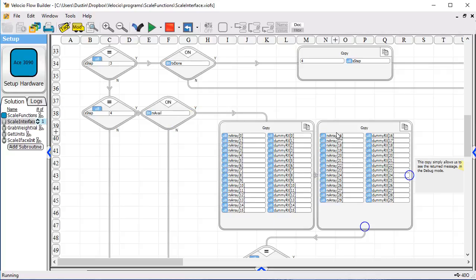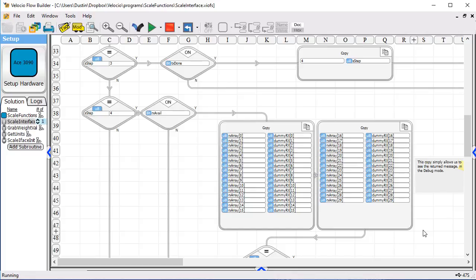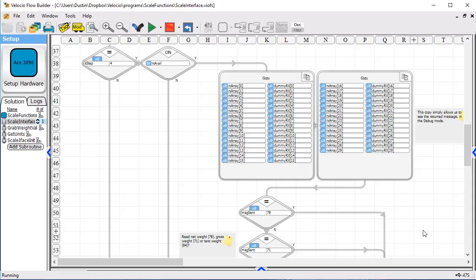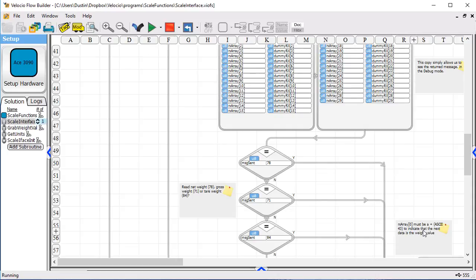we wait until we've got a receive available bit set. Once it is, these two copies simply allow us in debug mode to see what the message is. Each byte of the message, normally, once you are done, you would take those out of here. They don't actually do anything useful, but they're good for debug purposes.